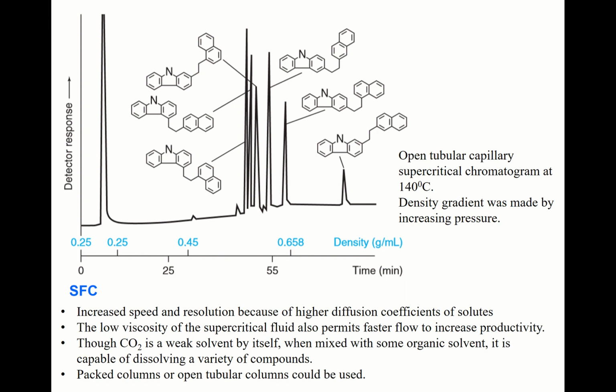This is the result. SFC is supercritical fluid chromatography. All these compounds are rather easily separated by supercritical chromatography.